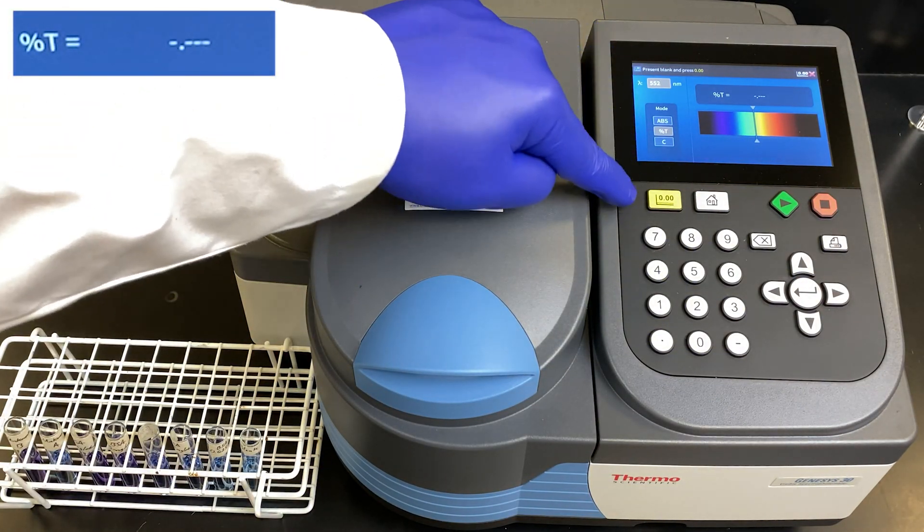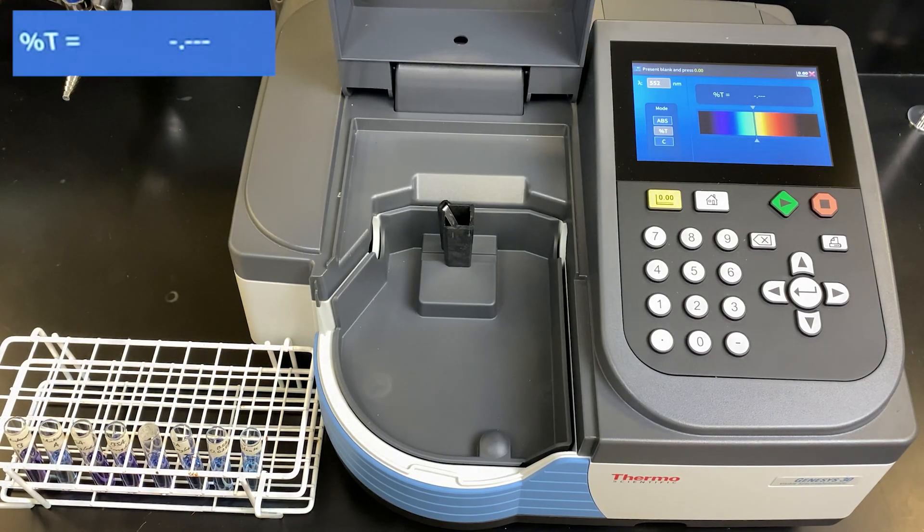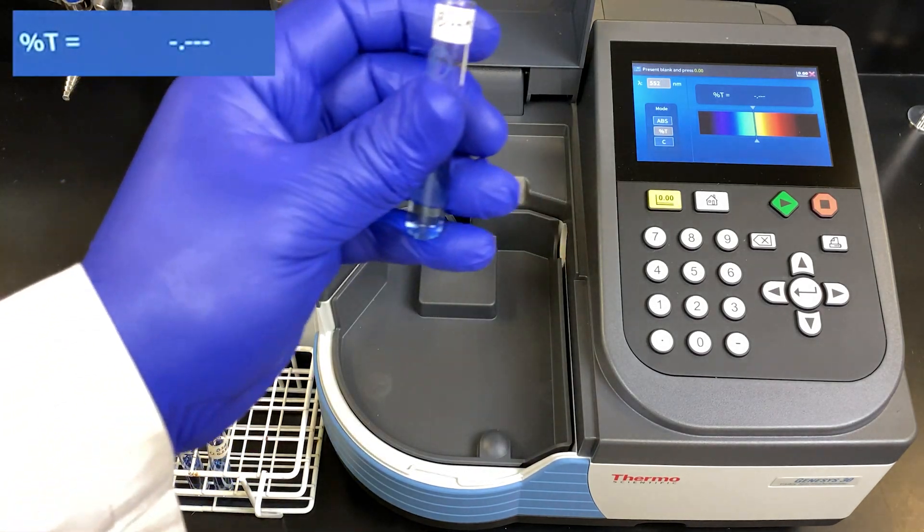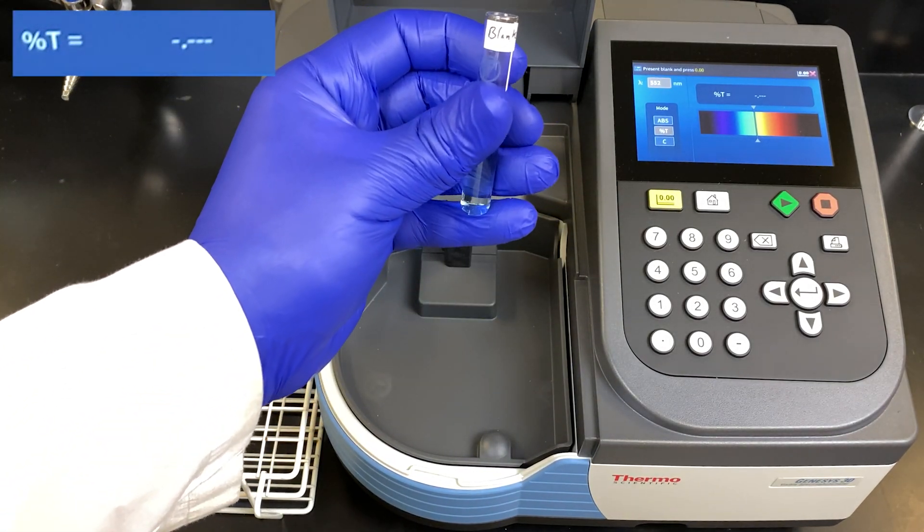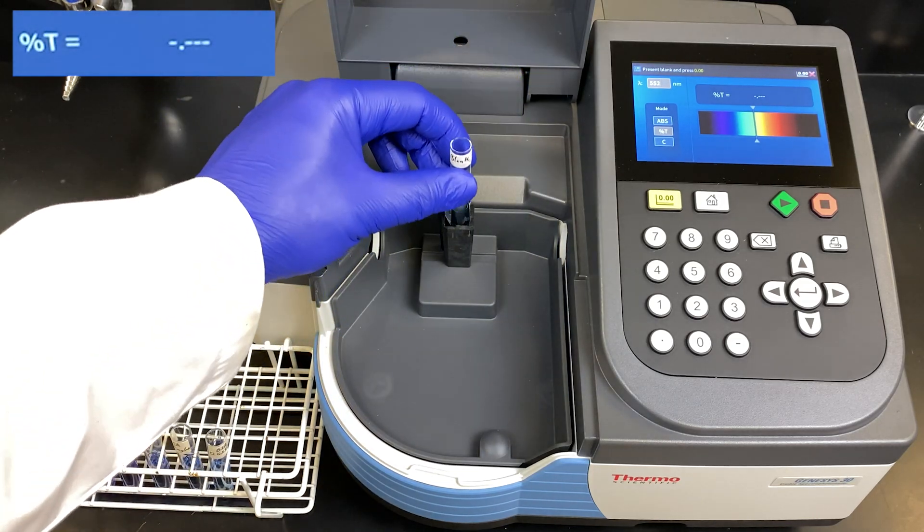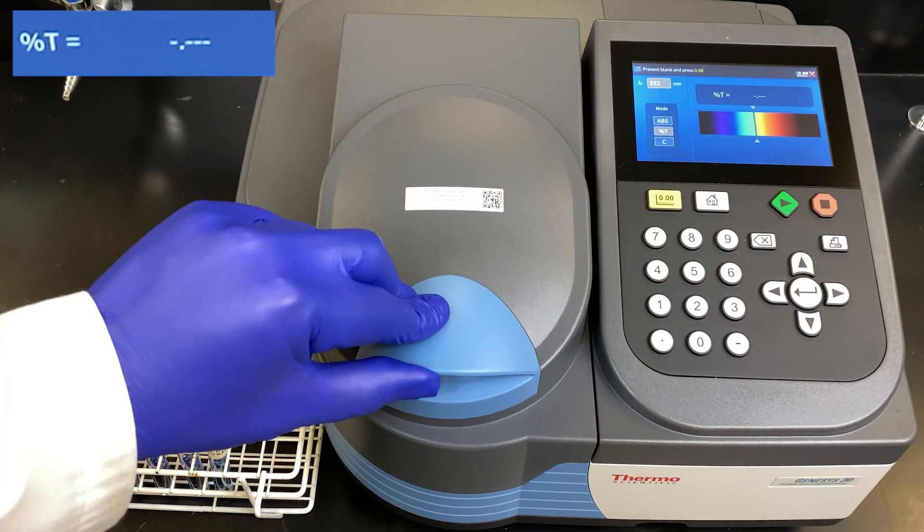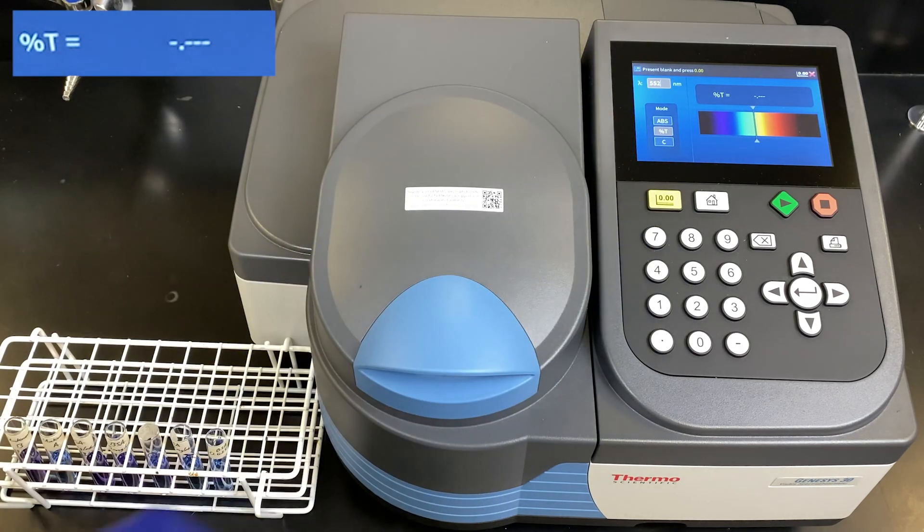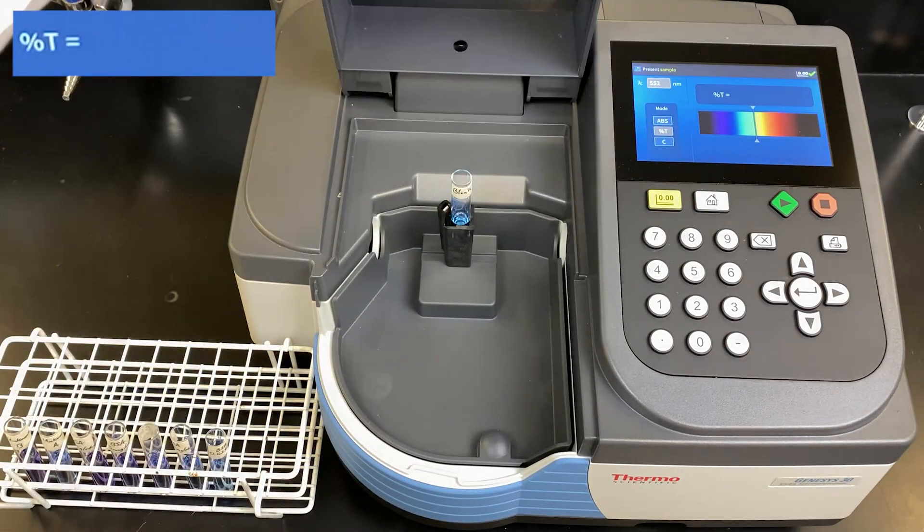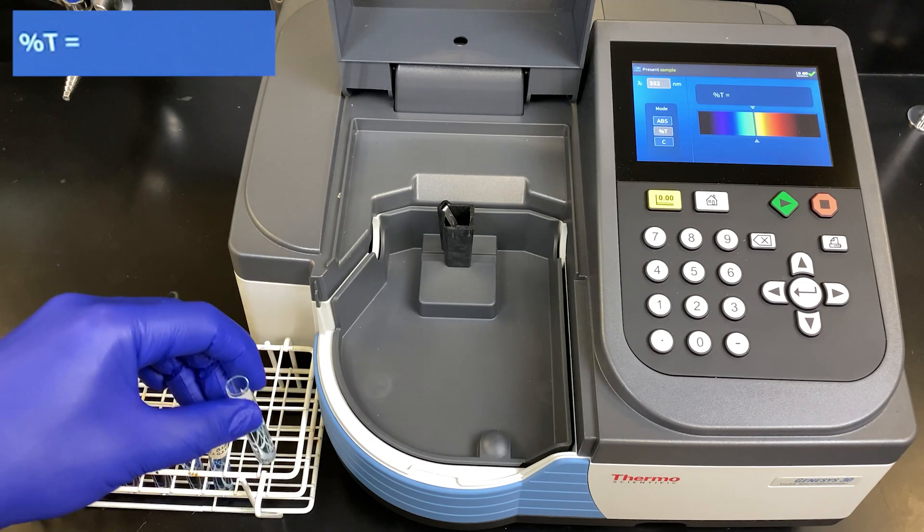We must now blank it. Here we're going to use our blank, which is the Biuret reagent with just water. Test tube. Place it inside. And press the yellow blank button. It now blanks the sample. This would be 100% transmittance.